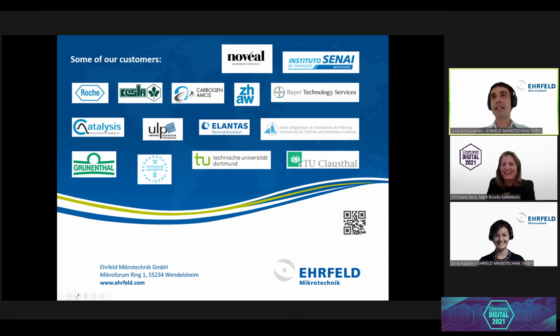In this case, for reactions to be implemented using our equipment, we are mainly looking for fast reactions, highly exothermic reactions, and also hazardous reactions, which in principle are too dangerous or difficult to be done in batch reactors.